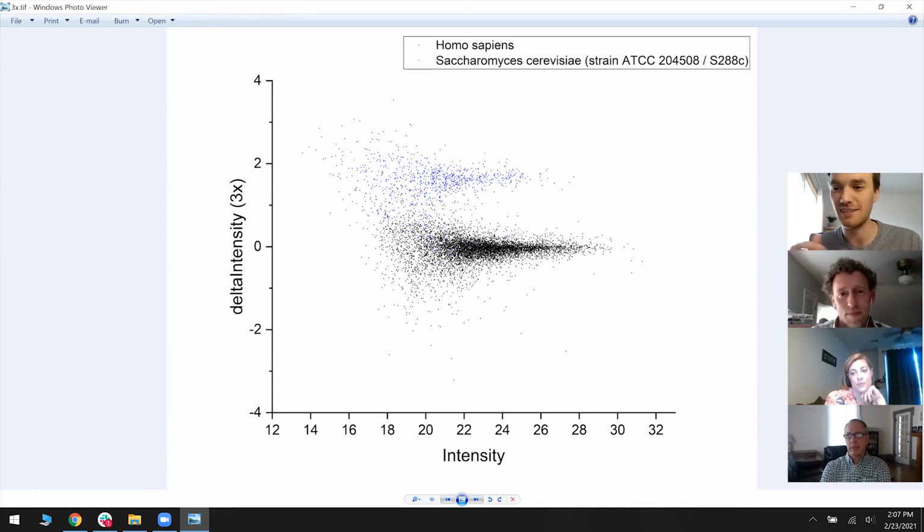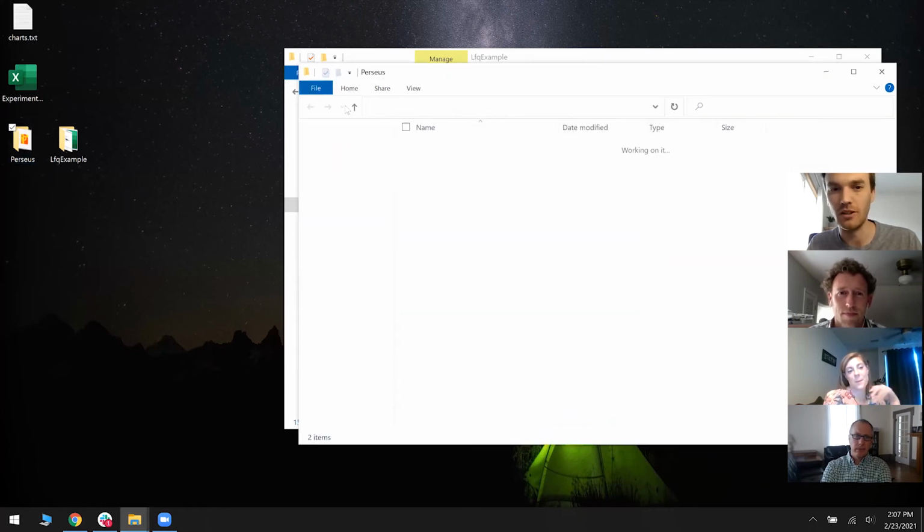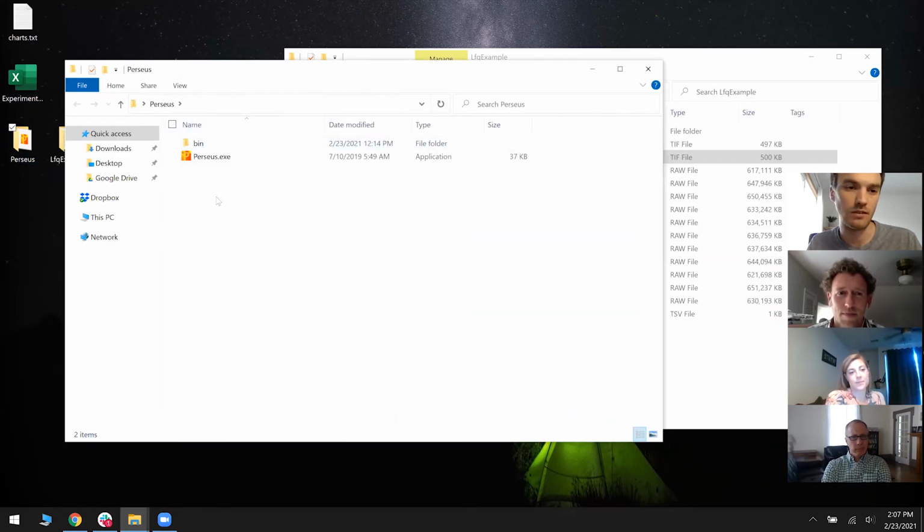You won't get a nice, separate distribution in real life when you're analyzing real samples. But this is just showing that the quant does actually work. That's why the spike and stuff is nice. You can tell which proteins are incorrectly quantified and which ones are correctly quantified.